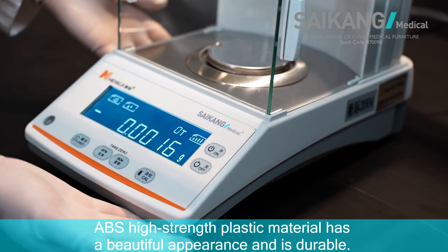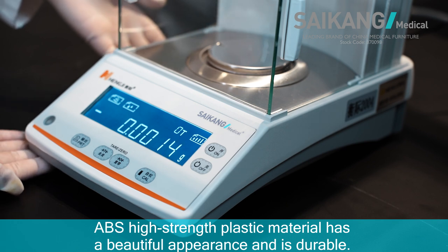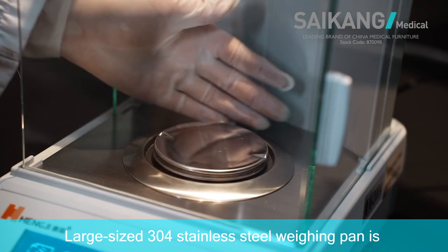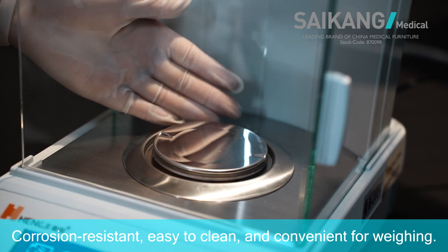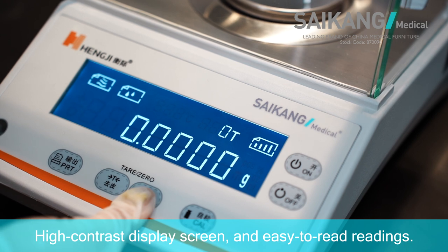ABS high-strength plastic material has a beautiful appearance and is durable. Large size 304 stainless steel weighing pan is corrosion resistant, easy to clean, and convenient for weighing. Highly contrast display screen and easy to read readings.